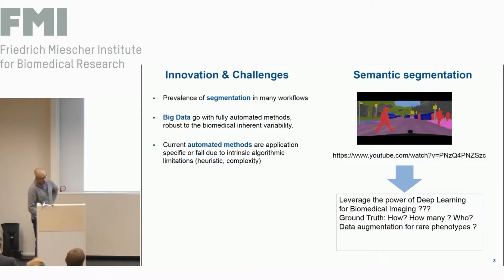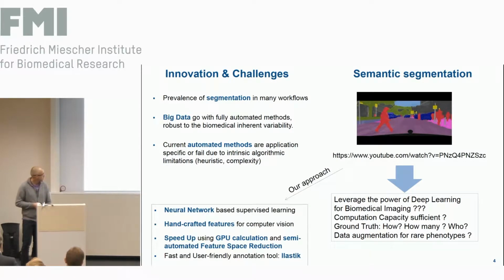Yeah. So in order to make use of all these technological advances in computer vision, but without going into the drawbacks of deep architectures, the approach that we chose was still to keep the neural networks to make a supervised learning, because neural networks are the horsepower of deep learning.